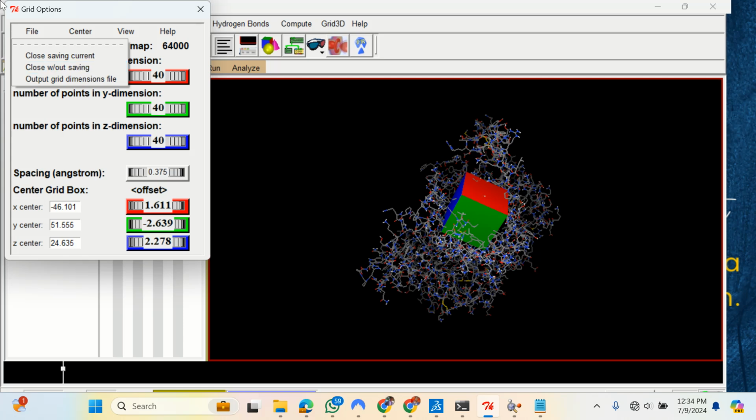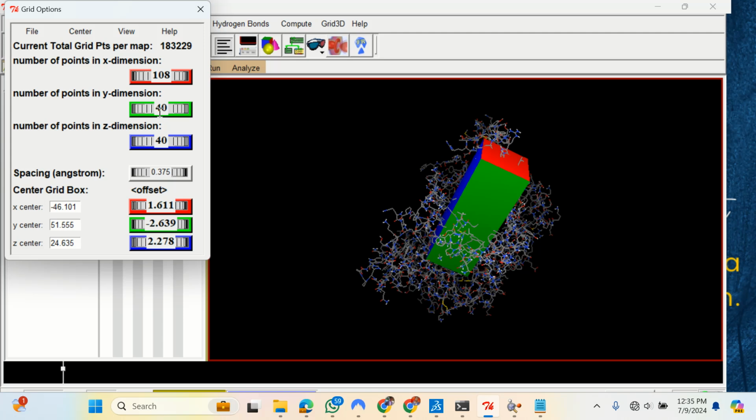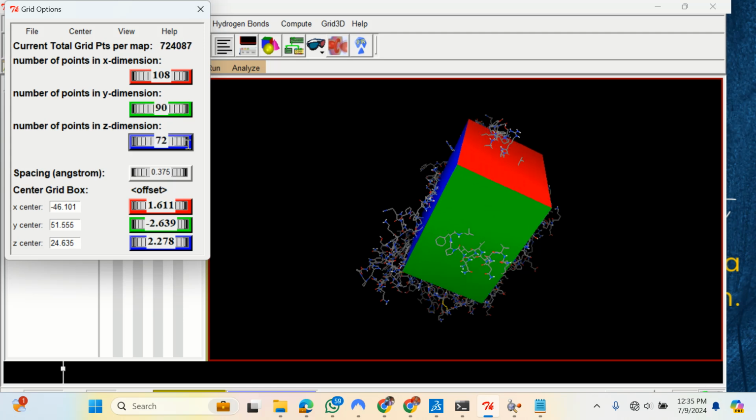You see 40 40. Okay, by default it will give you a 40. Look at what will happen to that. Do you see that? It's supposed to be a square. This will be inside. This particular one cannot shift from one position to the other, but it can expand the size of it where it's located. Why this automatically positions it. So these two work hand in hand. Are you getting it?